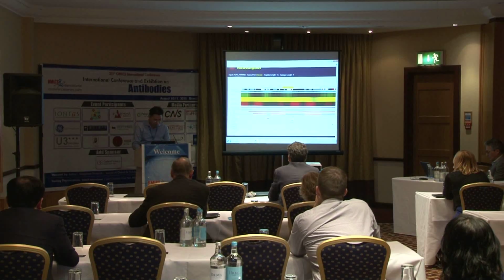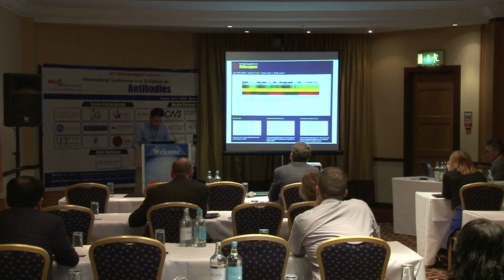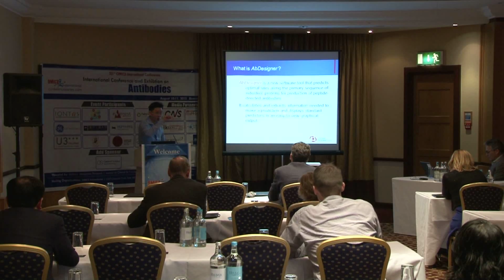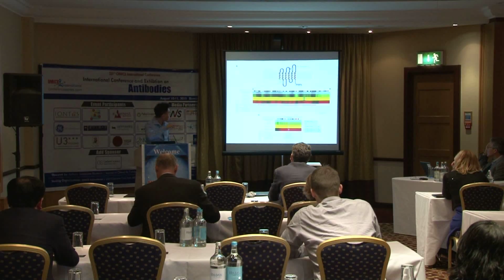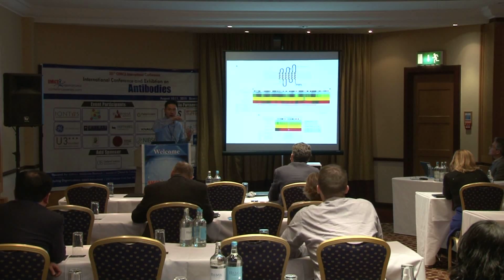Okay, going back again. To summarize quickly, this will grab much information into an easy-to-view graphical output. Most of the things that show up here are all the things that most people are concerned about when you try to make antibody.